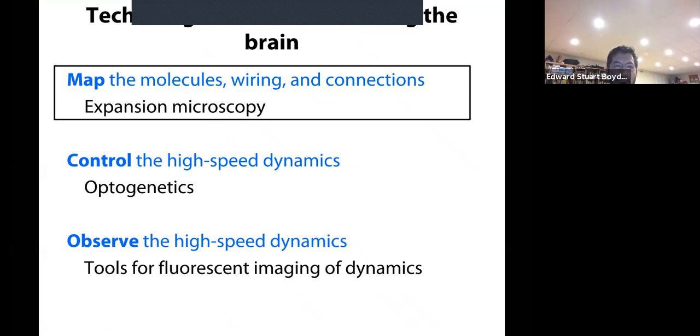And furthermore, as I showed you near the end, we also decrowd molecules from each other to improve the staining. The improved staining then allows for better imaging of dense proteins, like those at synapses, or those found in amyloid plaques, or other dense areas of cells. So please visit our website, expansionmicroscopy.org. We have some cookbook style, step-by-step protocols where anybody can learn how to do it. And new papers doing expansion are coming out all the time.